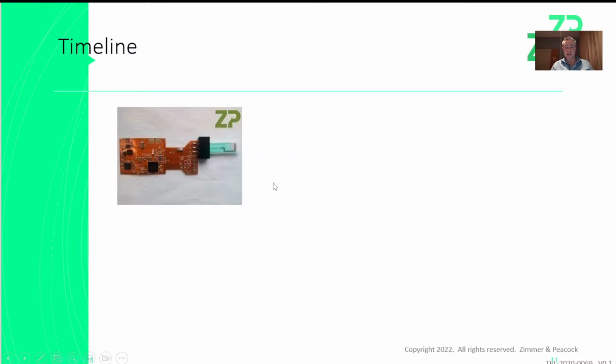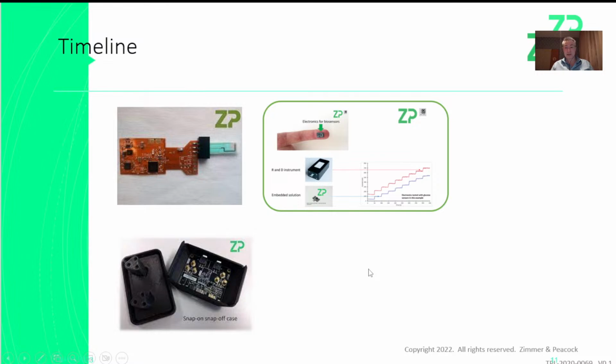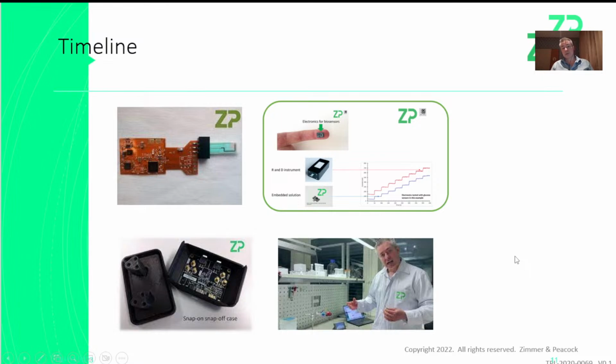So this is what the ecFlex looked like. As I say, it's about a 5-year-old product. These days, the potentiostat is about the size of the end of my finger. We do have a developer's kit for that ecFlex, and what's interesting is that the new technology is the same electronics that we now put into our academic potentiostats. So there's a seamless way that what we're doing in an R&D setting in our laboratory is the same technology that we're then putting into more commercially focused products as well.